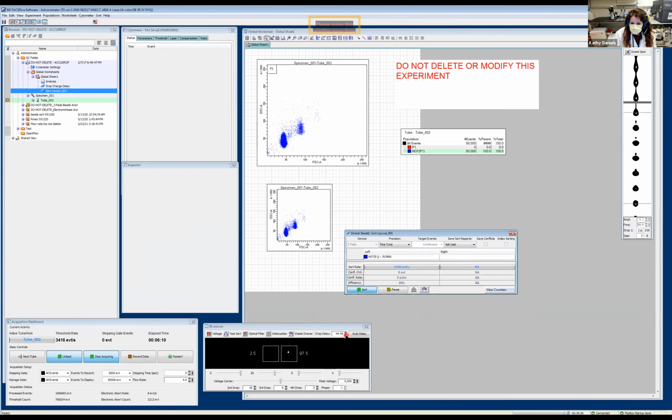So now I'm going to go back down one whole value. I did want to take the time to show this animation in Paint to show you exactly what's going on, but we're probably not going to have the time for that today.